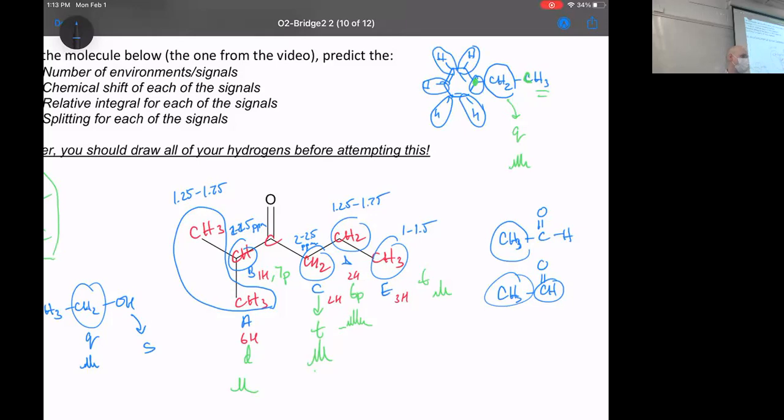So just looking at your carbon with the hydrogen, that's one environment. Just move over and look at those carbons. So when we start to do this backwards, what we will see for each of these environments is what we have, and then you'll see information about the neighbors. They're not represented in the signal, but you know that they're there. You're aware of their presence. And sometimes you can tell a little bit of information about functional groups farther away, but not about any more hydrogens.